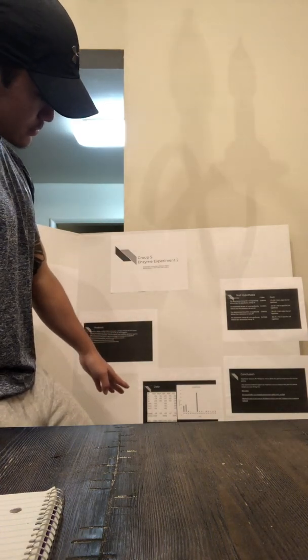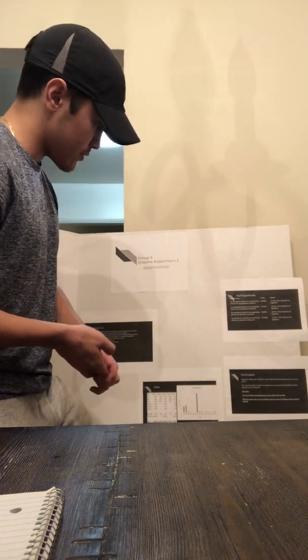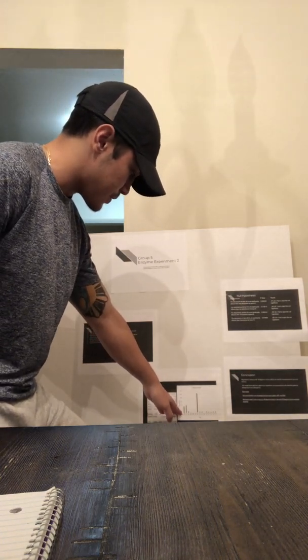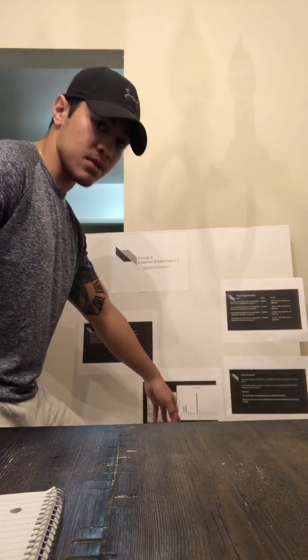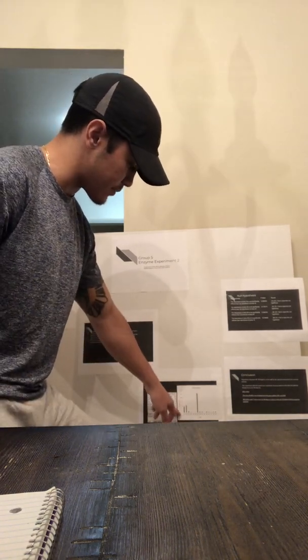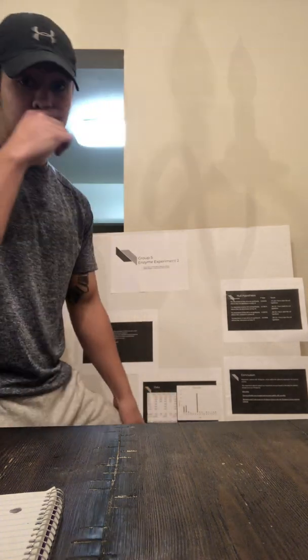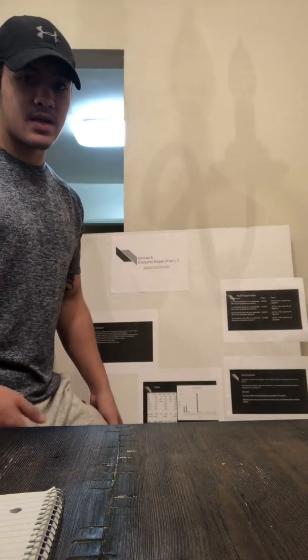Now, I'm not entirely sure how accurate this information is, because we did have human error within our experiment. In our 30 degrees here, 2 of them are above 0.15, while the other is below 0.1, creating an outlier. So maybe some of this information isn't correct. Secondly, in our 40 degrees Celsius sample, it has an absorbance level that is negative, and that's impossible. A negative absorbance level can't even happen.